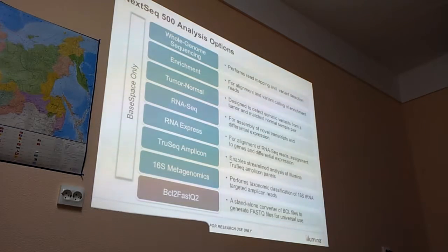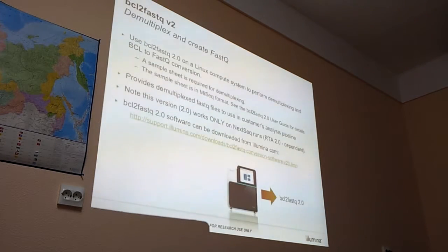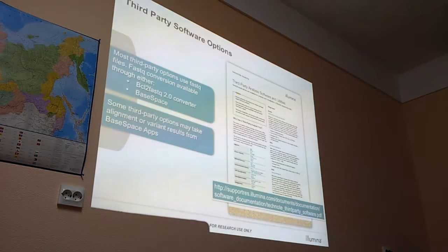Secondary analysis, we also saw this yesterday in BaseSpace, or BCL to FastQ, that's the other alternative. So if you want to use BCL to FastQ, we have a manual for this. So you can download it from the same location on our webpage as the software.